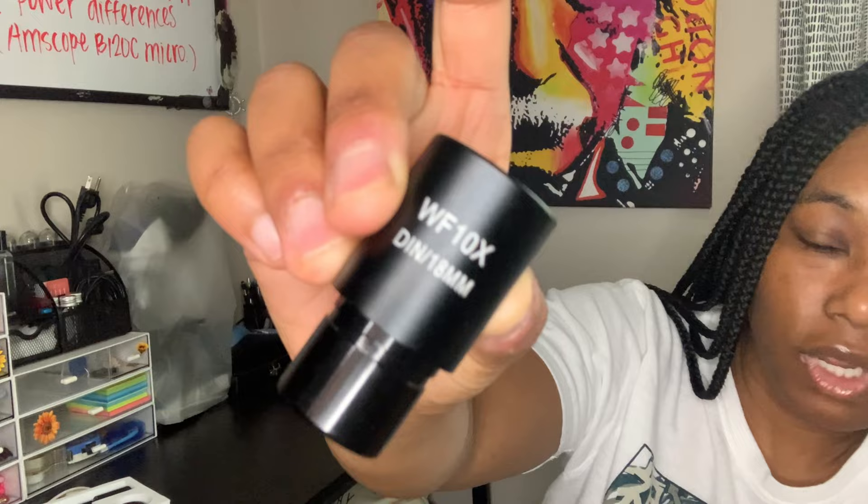Usually most microscopes come with the 10x. Where you see 'DIN' on it, it's basically saying this is a manufacturer standard that works with pretty much any other microscope that has it, so if y'all see that it'll probably work with another microscope. And here is the camera — you just plug it into your microscope as well. Those are the ocular lenses.